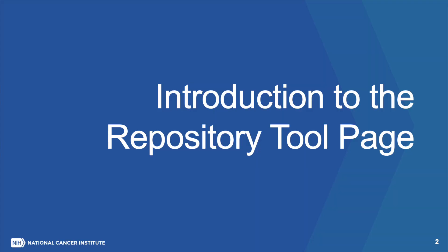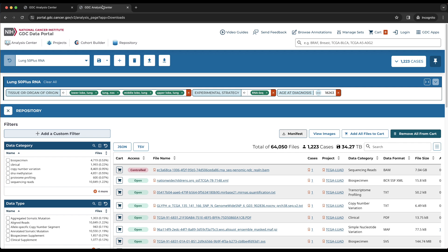Introduction to the Repository Tool Page. The repository tool table includes all files that are associated with the active cohort. The top of the table displays summary information about the files, such as the number of files, the number of cases, and the file size of the entire data set. The top of the table also includes buttons to download the table in JSON or TSV format.